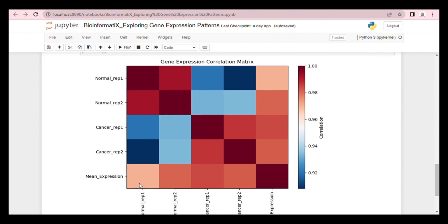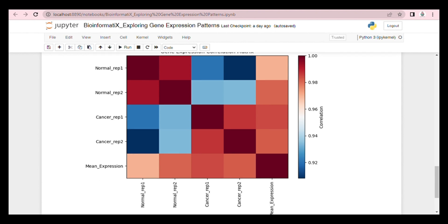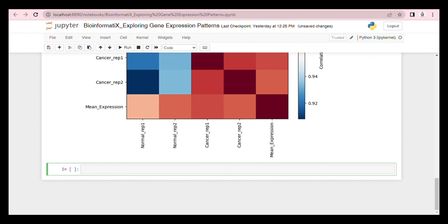The gene expression correlation matrix measures the correlation between the expression levels of different genes across all samples. It provides information about the overall patterns of co-expression among genes within and between the control and cancer groups. The reddish the colors, the higher the similarity; the darkest blue the color, the higher the dissimilarity. For example, cancer RIP2, normal RIP1, cancer RIP2, and normal RIP2.